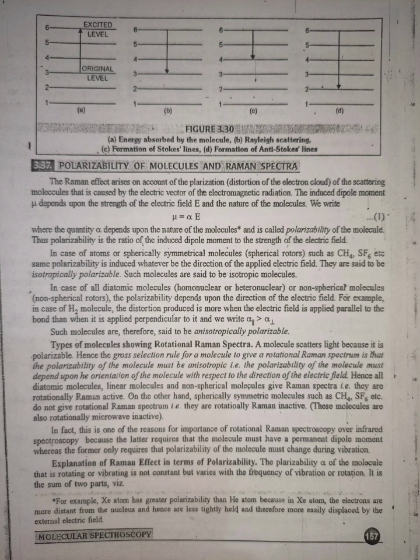In fact, this is one of the reasons for the importance of Raman spectroscopy, because infrared spectroscopy requires that the molecule must have a permanent dipole moment. However, the former only requires that the polarizability of the molecule must change during vibration.